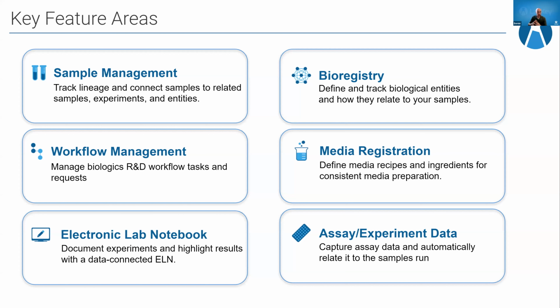So we have a variety of facilities for receiving and producing sample manifests, things like work lists. We have people that use our system in communication with systems like that, but we are always eager to make those more efficient, easier to set up, things like that.